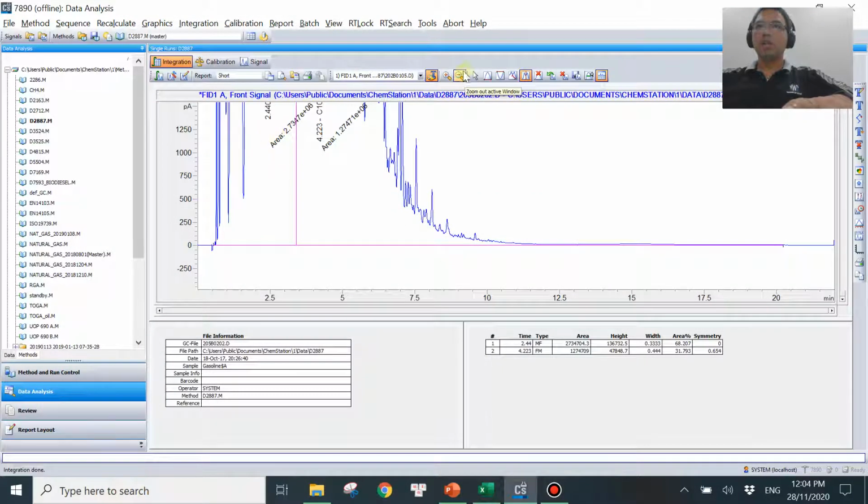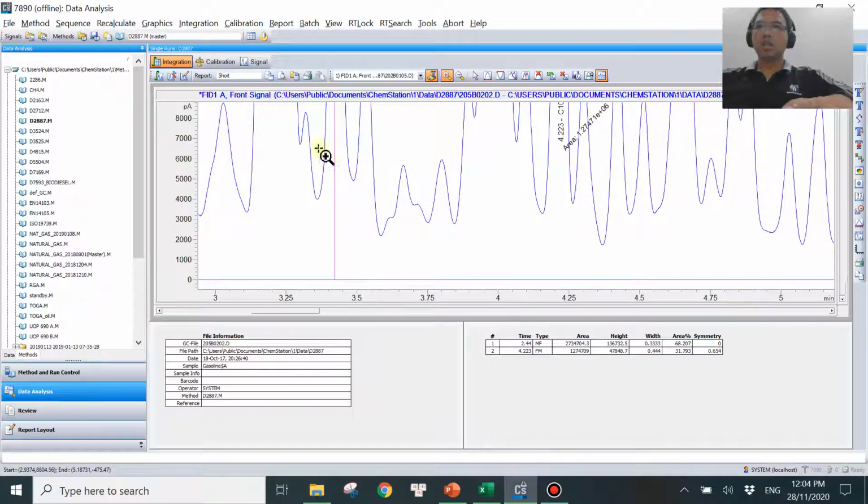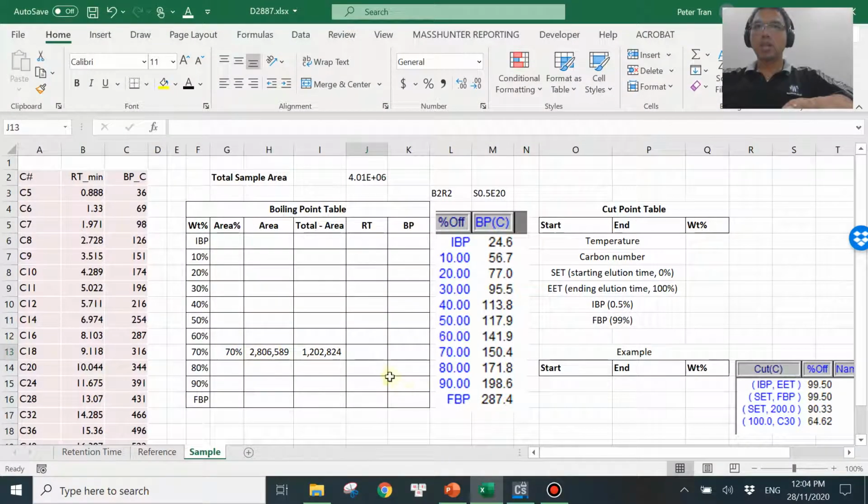All right. So what I need to do, I can zoom in a little bit more, like this. Okay, so here is giving me 2.7. So I can keep this one as my reference point. I can click this one. I can select another one, let's say somewhere here. Now what you need to do is take this error count plus this one to end up with this one, in order for you to compare with this number. But that will be a bit difficult for you to do like that.